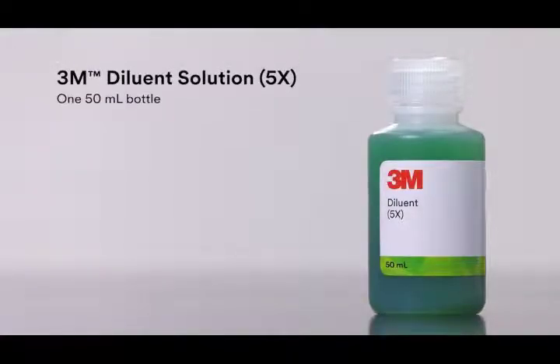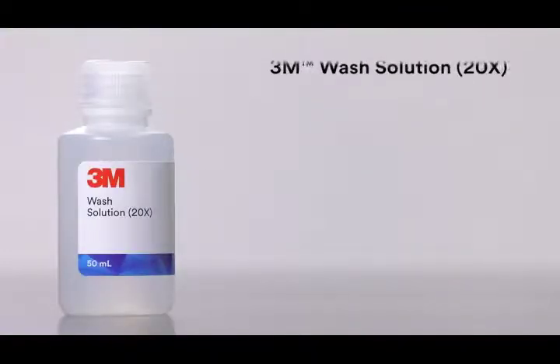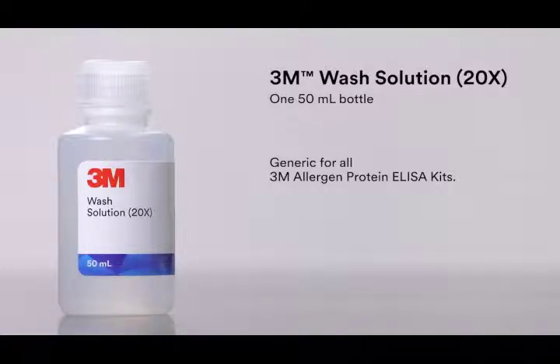One bottle with 50 mLs of 5X 3M diluent solution, generic for all 3M Allergen Protein ELISA kits. One bottle with 50 mLs of 20x 3M wash solution, generic for all 3M Allergen Protein ELISA kits.